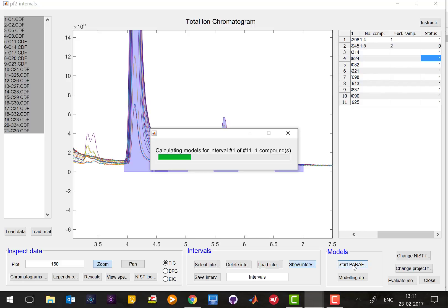And in that case depending on the number of samples you have this can easily take more than a day or even days worst case. But the good thing is you don't have to sit and look at it, you can just come back later and then see what has happened and go through the results. And that's what we're gonna do so let's leave for now and let the computer calculate a little bit on all the intervals.